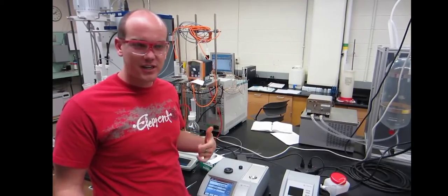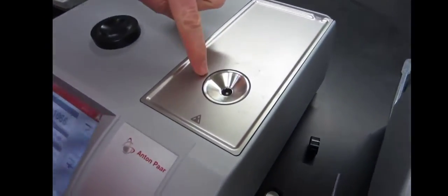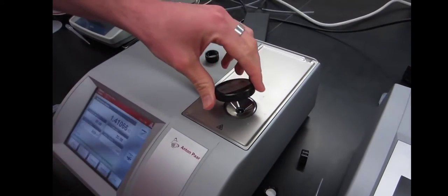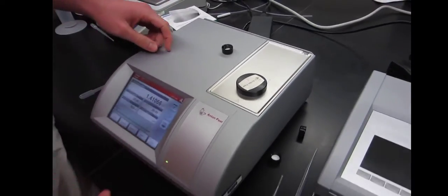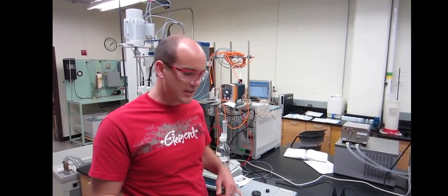After we take the samples of the distillate and the bottoms composition, we come here, we insert the sample into this receptacle right here. We put the lid over it. We fill about halfway full, put the lid over it, and all you do is hit start. It'll give you the refractive index. After which we have an Excel sheet provided to us on the problem statement, and we use that to convert that to composition.